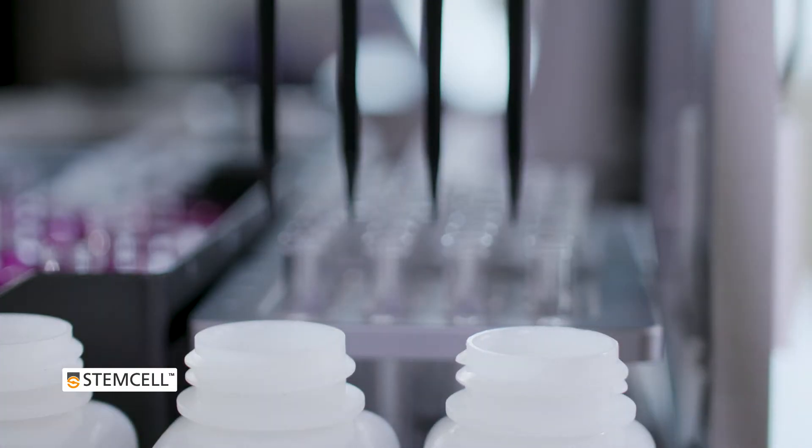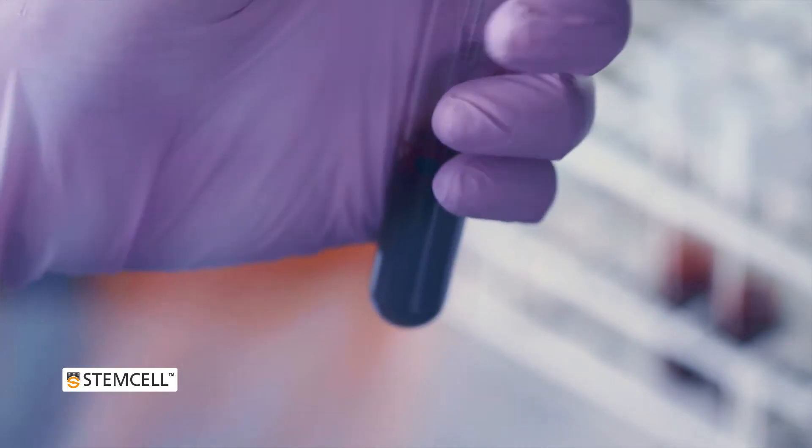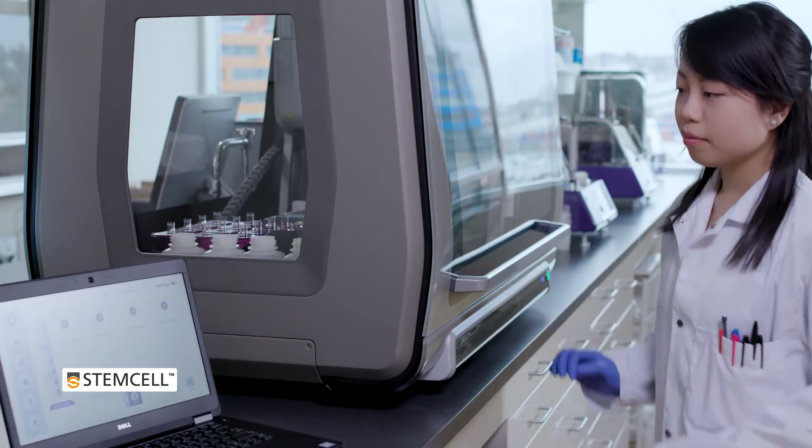The instrument is capable of isolating cells from a variety of samples, including whole blood, bone marrow, and mononuclear cells, and is easily operated through a simple and intuitive user interface.